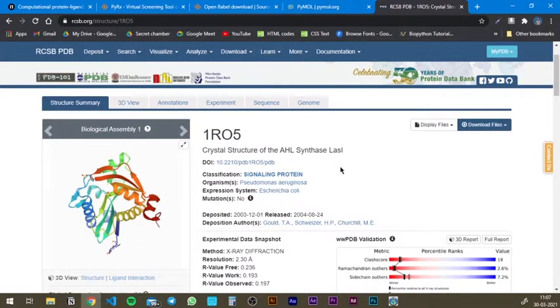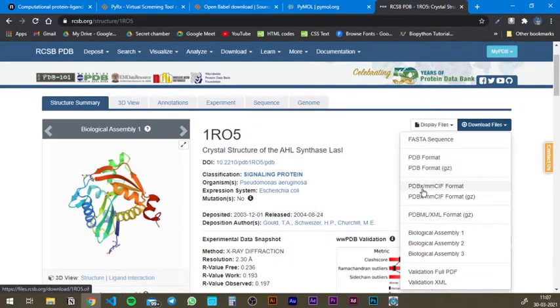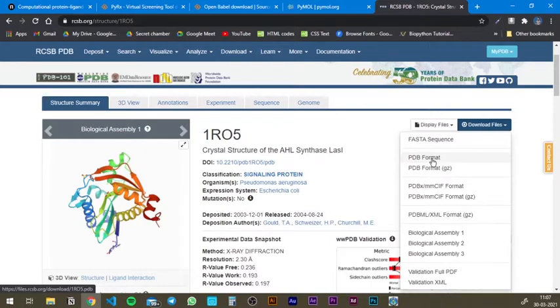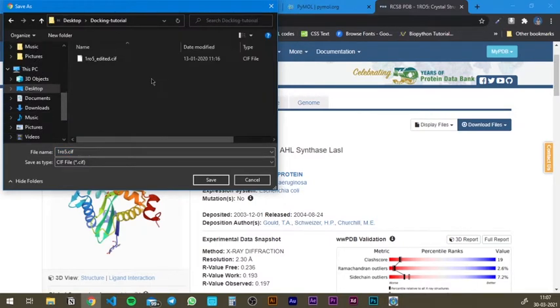For the download, you have display files and download files in the right corner. Hit download files — you have the FASTA sequence and a couple of different formats. You can download the PDB format, which is the standard protein databank format, or the PDBX/MMCIF format. I recommend downloading the PDBX/MMCIF format because this format is always recognized by Pyrex, whereas the PDB format is sometimes not recognized. So hit PDBX/MMCIF and it will prompt you to download. I've already downloaded it, so I'm not going to download it again.